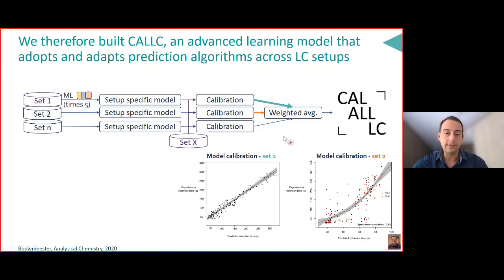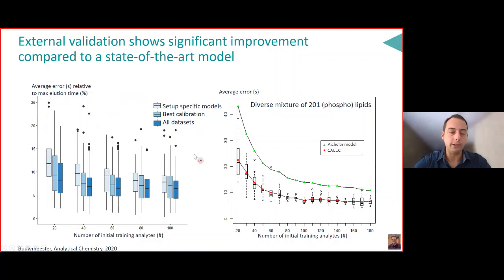But still, and this is very important, despite the fact that set 2 is a reasonably poor fit, it still helps to improve the final model that we get, because there is a certain fit and because it can attenuate some of these predictions and make them better. I'll show you that on the next slide where we evaluate this.